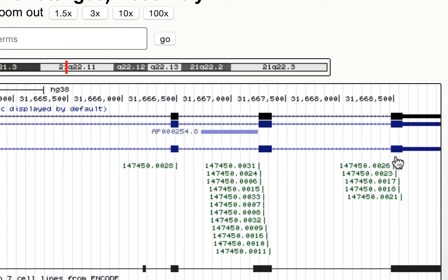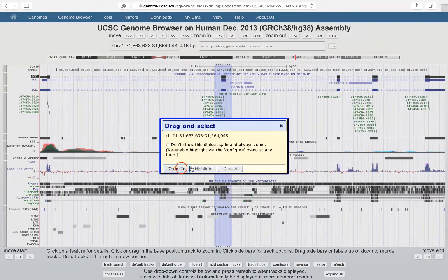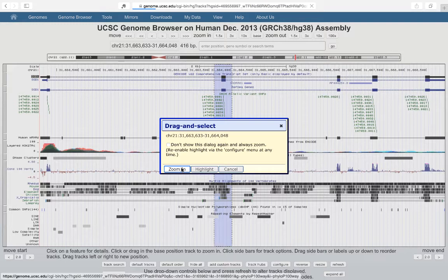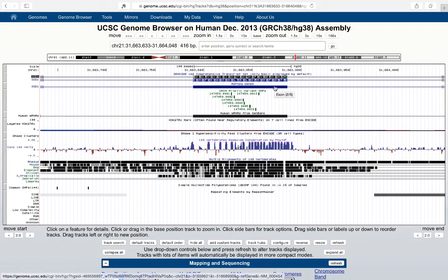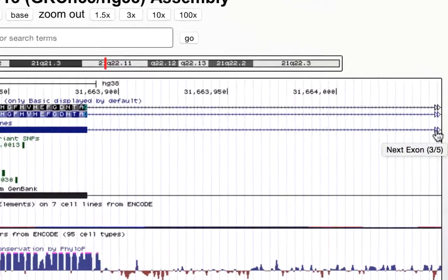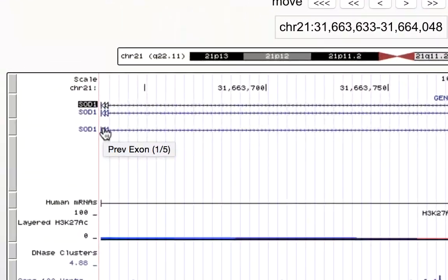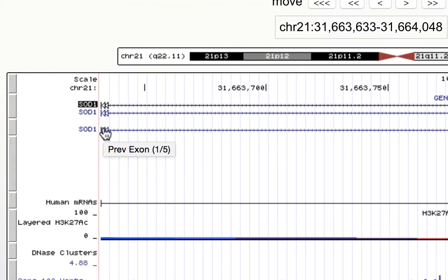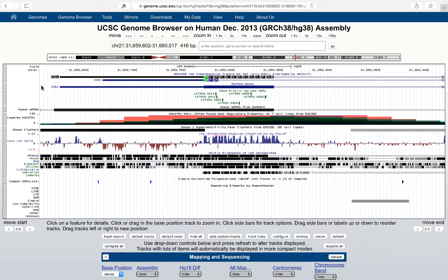Now let's zoom in on one exon and learn more about it. Now if we're zoomed in on this particular exon — this is exon 2 of 5 — and I want to understand where the other exons are, I can go to this double-headed arrow on the right, and it'll show me that the next exon is 3 of 5. If I go to the left, it'll show me that the previous exon is 1 of 5, and I can click that to move there. Now we're looking at exon 1.